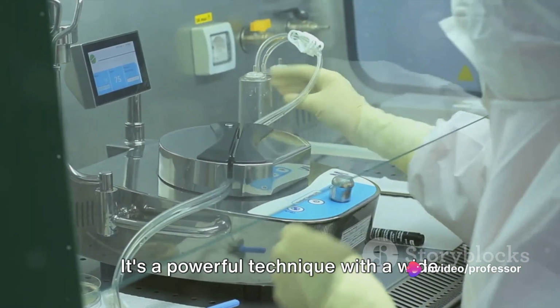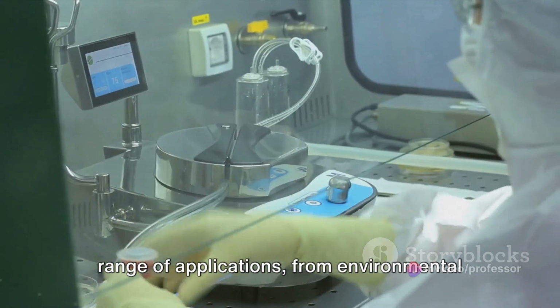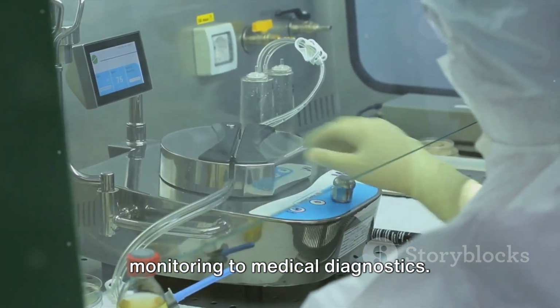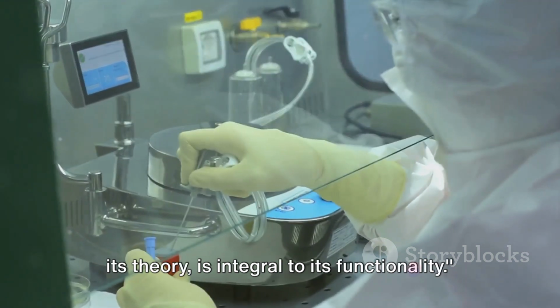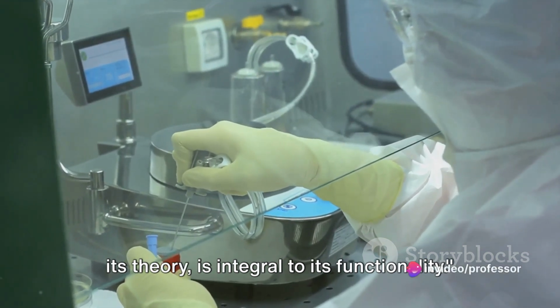It's a powerful technique with a wide range of applications, from environmental monitoring to medical diagnostics. The principle of amperometry, just like its theory, is integral to its functionality.